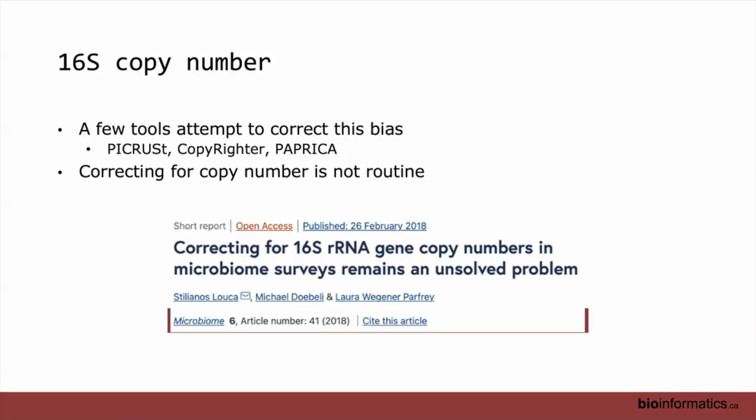What's the benefit of normalizing for copy number? It depends what's most useful for your community. Typically, if I were writing up a 16S study, I would describe something as the abundance within my 16S community. And that is not the same thing as the abundance within the original community that you started from. So if you were able to normalize it efficiently enough, then you would effectively be able to know how abundant that was in your original community versus within the genes that you sequenced. Does that make sense? Yeah.